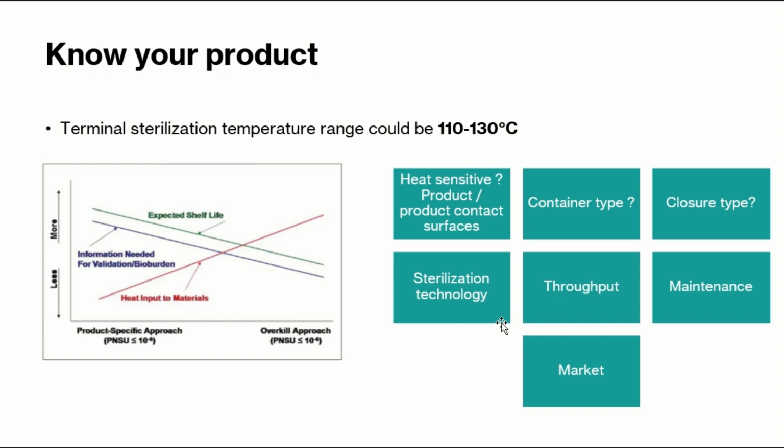but the precision of the temperature distribution could be very nice, well distributed across the chamber, because the hot water directly touches your bag. So it's a different technology. You must consider and analyze which technology is fit for you.